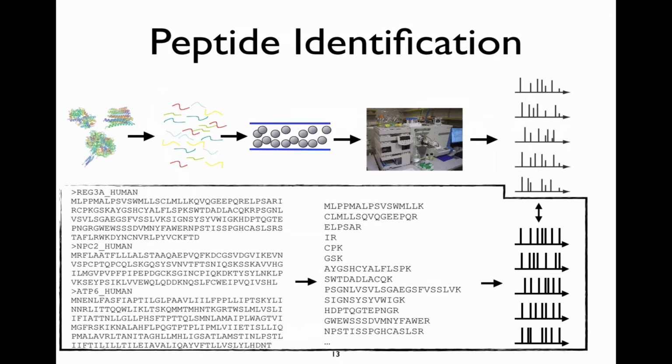The way we do inferences in this system is that we simulate the process by taking the database containing all the amino acid sequences of the proteins that we are expecting to turn up in the sample, and we simulate which peptides they will give rise to and which theoretical spectra they will obtain. We then end up matching this reality with the experiment that we obtain.